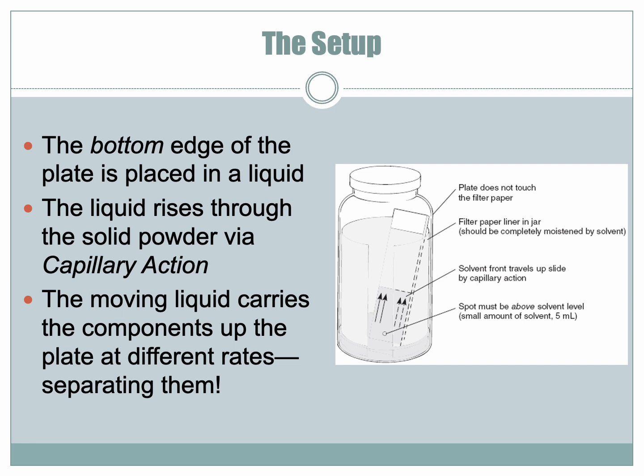So the bottom edge is placed in a liquid, a shallow pool of liquid. It can't go over the spot. The spot must be above the solvent. The liquid rises through the solid powder via capillary action. So just like if you dip a paper towel in some water, the water climbs up the towel. That's what's happening here too. The solvent climbs up the card by capillary force.